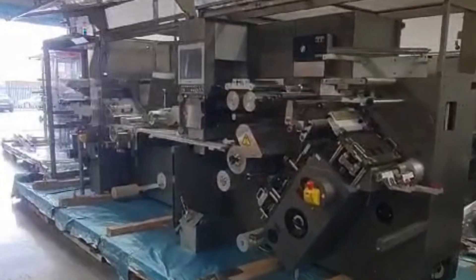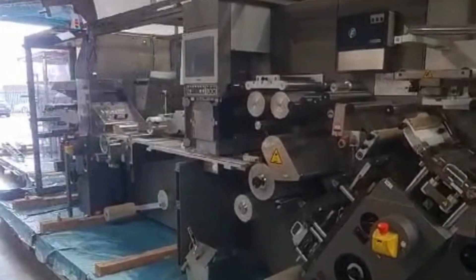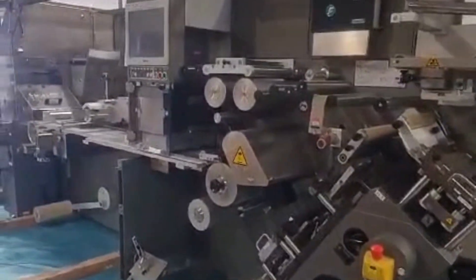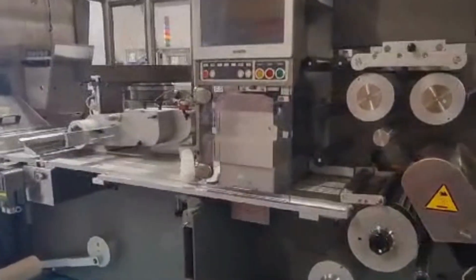This is the IMA C80 blister packer, just arrived into stock. As you can see, it is a lovely machine, extremely well maintained and cared for by the previous user.